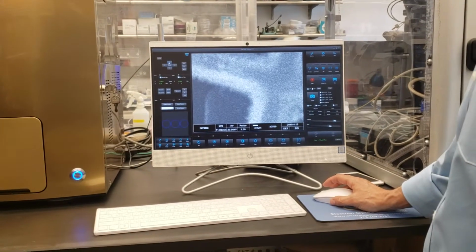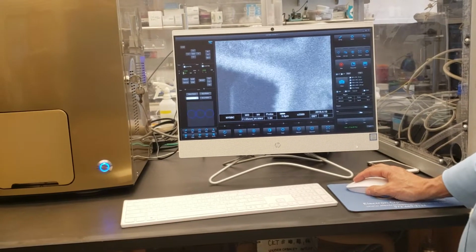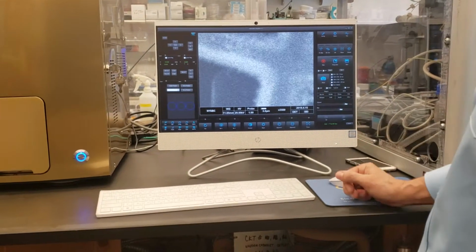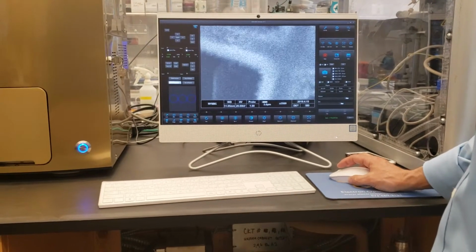So again, the stage program, X, Y, center, Z, basically you would just delete this value, you put your own value, and it lets us know where we are. So just keep in mind, 10 millimeters is pretty good. That's what you kind of want to be at. You can tell it to go to different Z levels as well, and you could also save positions.